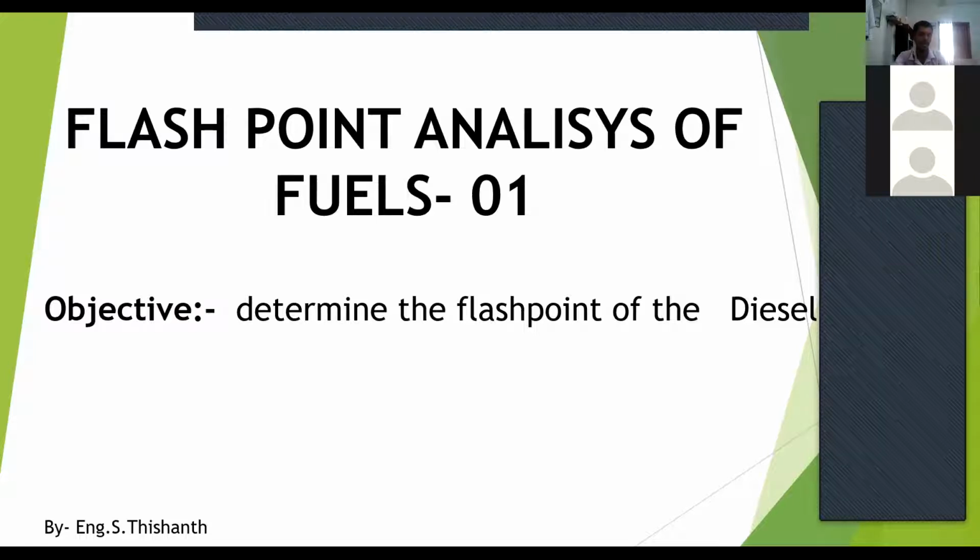In this first session, we are going to look at how we test and find out the flashpoint for diesel fuel, right? I have already done this practical in our laboratory, and I recorded a video. After explaining the apparatus and everything, I will play the video, and later, if you have any doubts, you can ask and discuss with me, right?